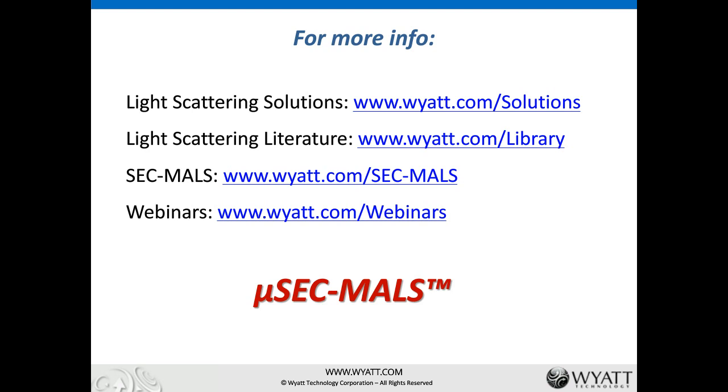Could this technique be applied to synthetic polymers? For sure, yes. We have routinely measured polystyrene. So the answer is yes. And you can also run microDAWN with APC, so no problem. Organic solvent is also compatible with microDAWN.